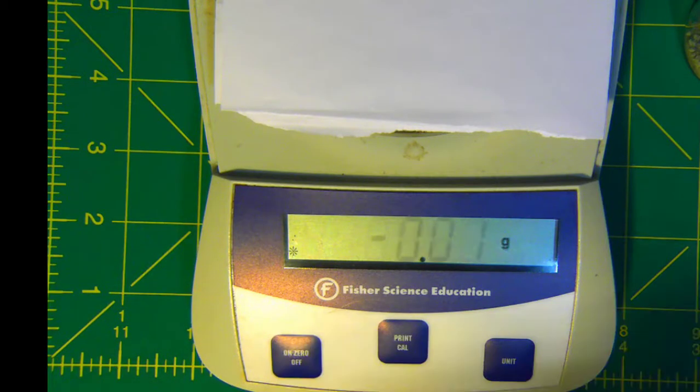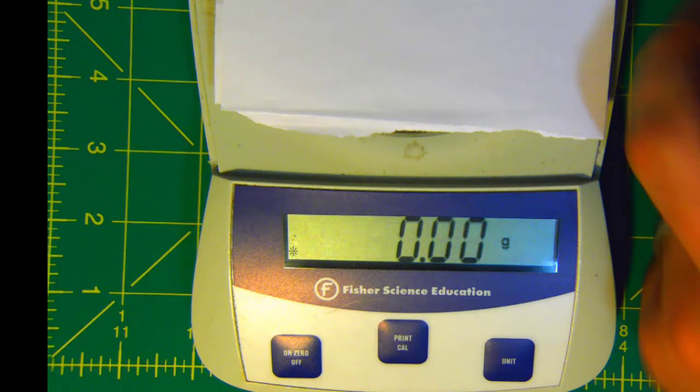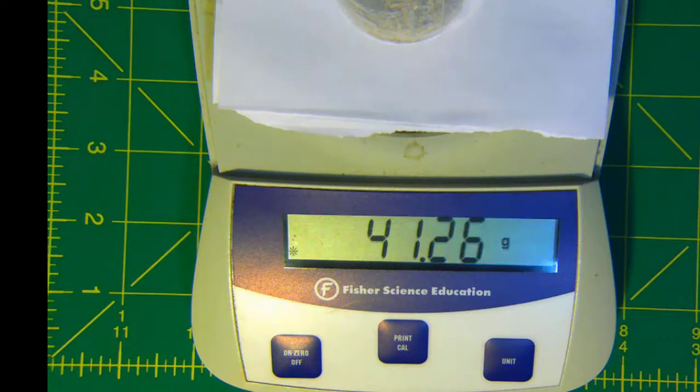I can tell you what probably happened there. I was probably too close to the balance when I did that, and some of the sand dust might have interfered with the measurement. So let me go ahead and put this back on. So that is the mass of the sand plus the beaker. So you'll write that down for that second part.